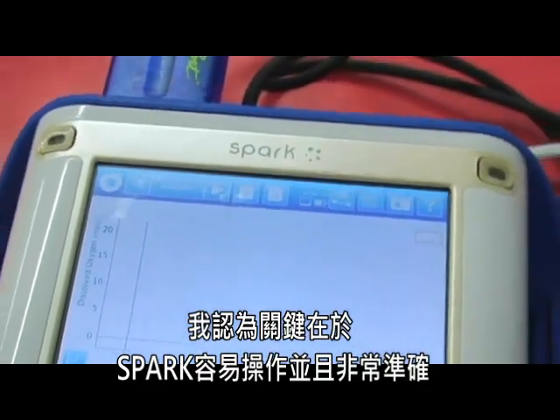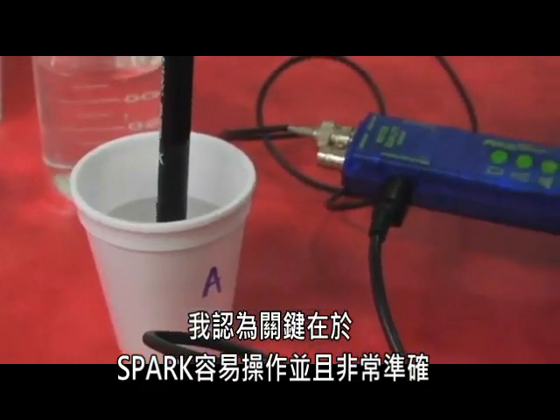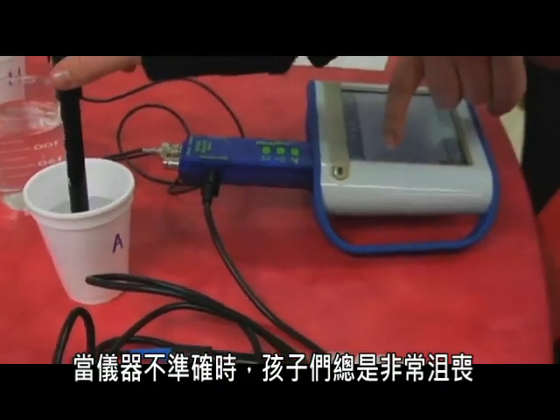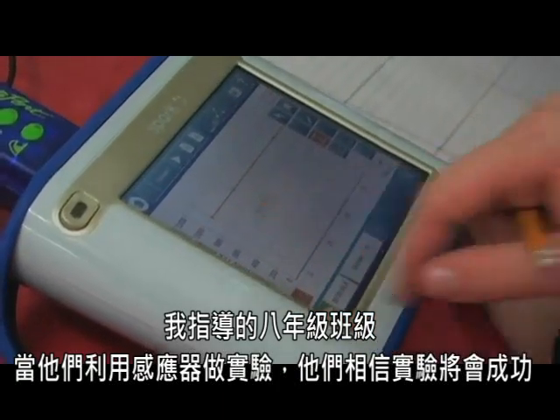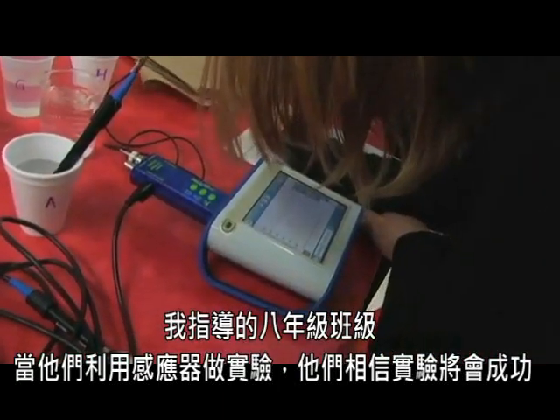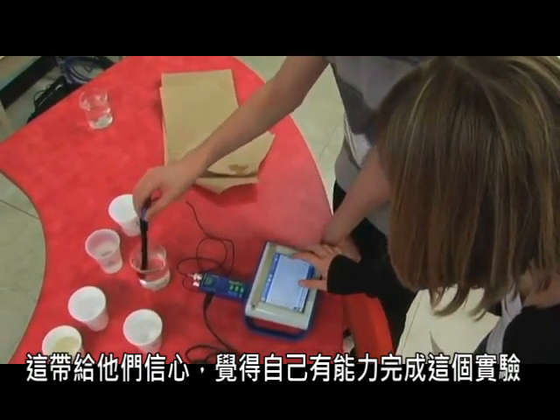I think the key is that they are easy to use, and they're really accurate and they work. Kids get very frustrated when stuff doesn't work. My grade 8s, when they've designed an experiment around a probe and they go to use it, they know it's going to work. And that gives them confidence. It makes them feel like they know what they're doing.